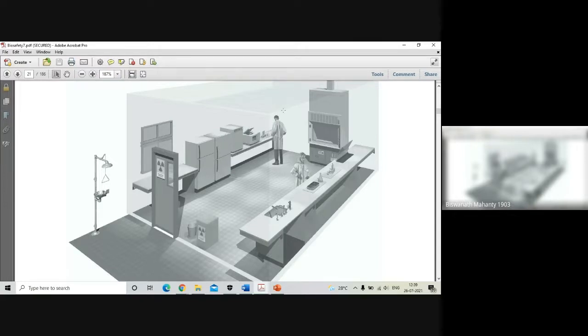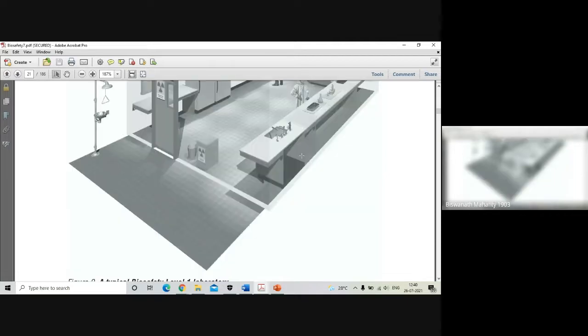And we can also have airflow cabinets like laminar airflow systems. Vertical system it is showing. But basically there are not many precautions. People should definitely be using gloves, decontaminating solutions should be there, and disposables identified with contaminants you can put in biohazard contaminant bags. Okay, so this is what I'm looking for. This thing you see outside, we can also have facilities for showering, but it may not be really necessary for biosafety level 1, the design.